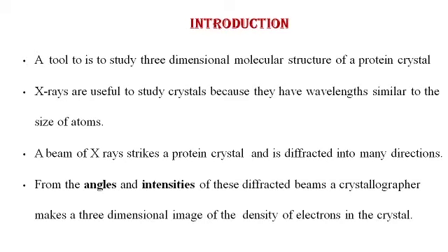To introduce X-ray crystallography, which is a tool to study the three-dimensional molecular structure of a protein crystal. X-rays are particularly selected to study the crystals from amongst all the rest of the rays just because they have a wavelength similar to the size of the atoms that are present in a protein crystal. A beam of X-ray strikes the protein crystal and it is diffracted into many specific directions.